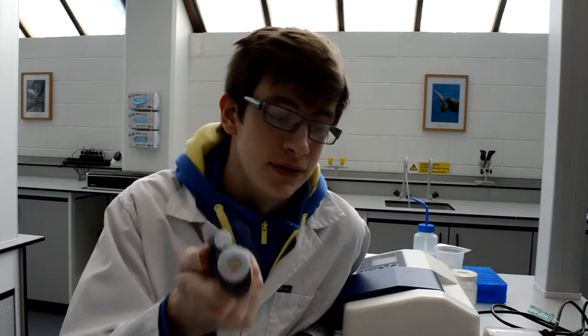Micropipettes and micropipetting is one of the most fundamental parts of biochemistry, is how we measure things at very small quantities on the microliter level. They can come in a variety of different sizes, from down to 2 microliters all the way up to 1,000 microliters or 1 milliliter. And believe it or not, they're relatively simple when it comes down to it.